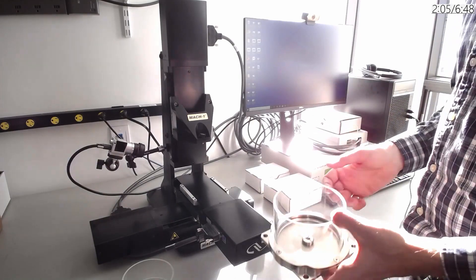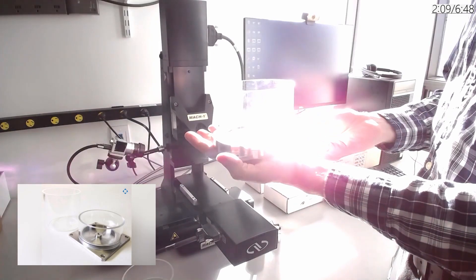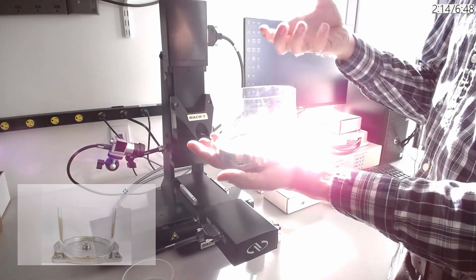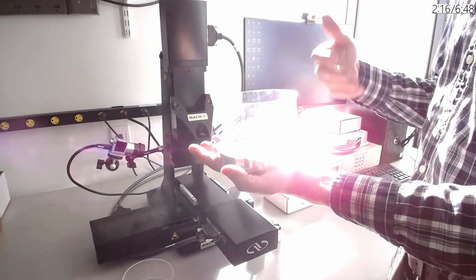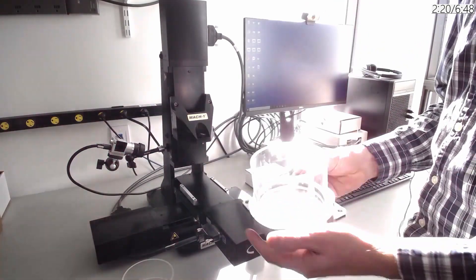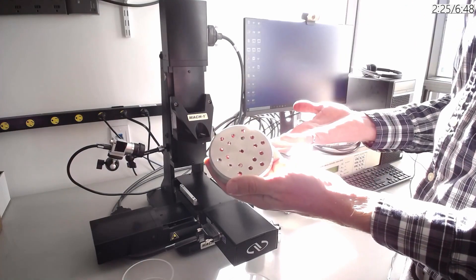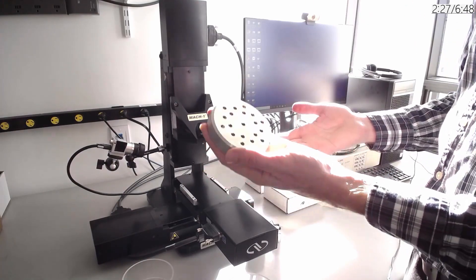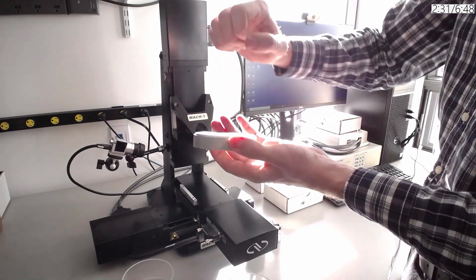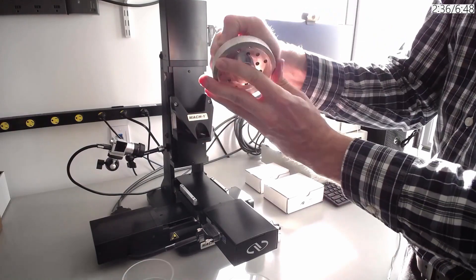Here are some more accessories that can be added onto the system. This is a stainless steel chamber with an acrylic wall that can be used to test samples within a solution, and the solution can also be heated if you want to test within physiological conditions. We have many custom holders because every biological sample is different. This is one that's specific for holding a sample where you have a bone or hard section — you put your sample on top and then you can drill through the bottom to drill directly into the bone.